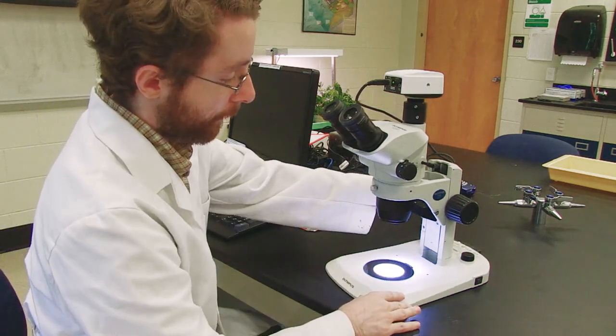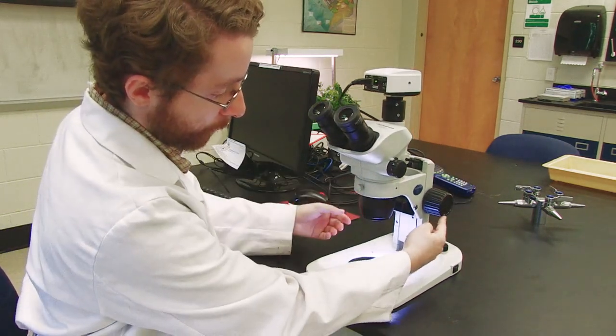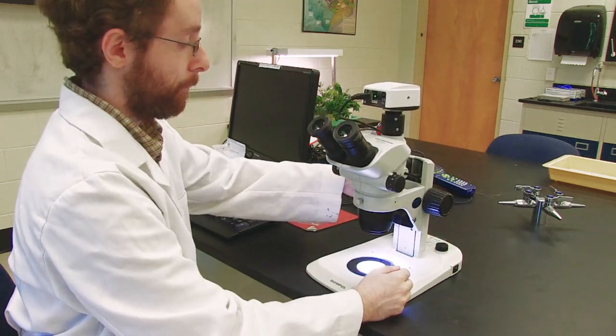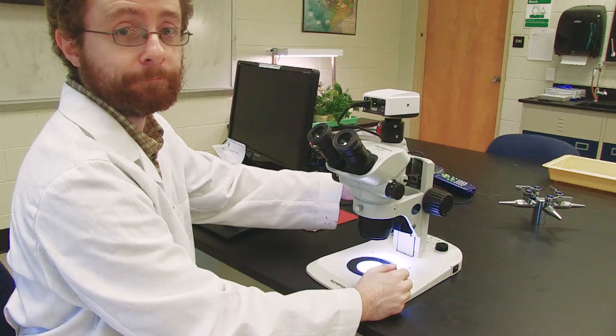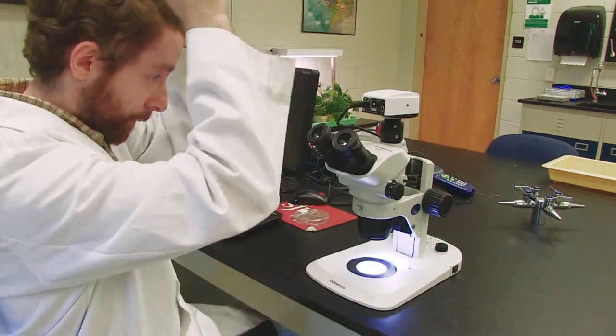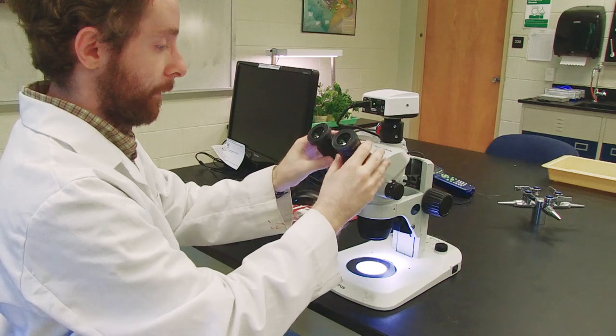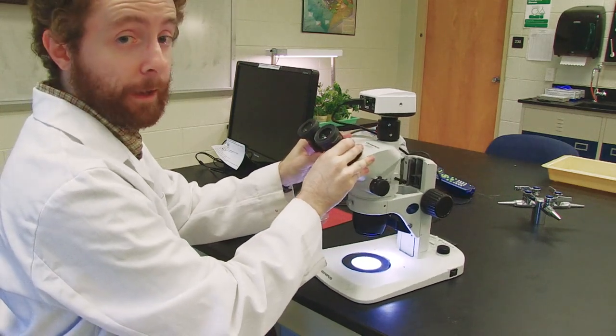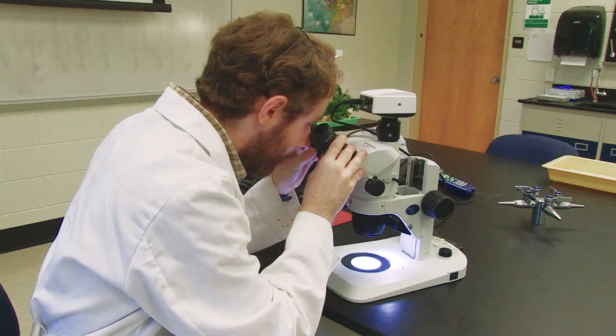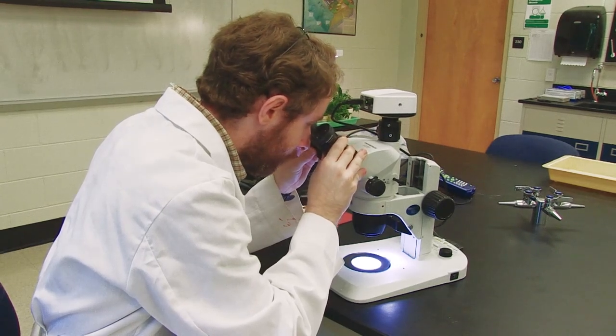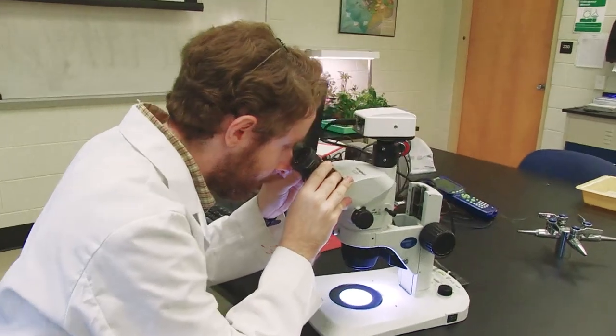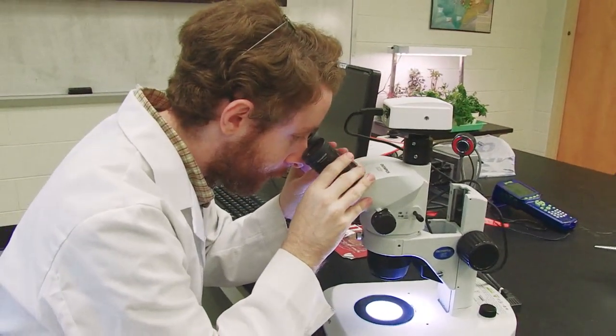We begin by taking our focus knob and bringing it all the way down to the bottom. I next take my oculars and like a pair of binoculars, I'm going to look through the microscope and adjust the oculars until I see one field of view, so one circle.